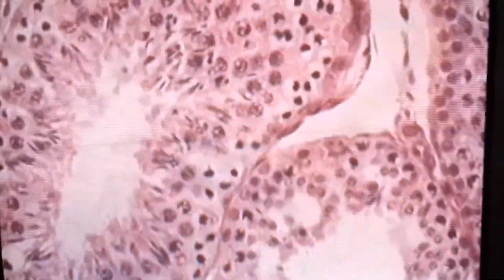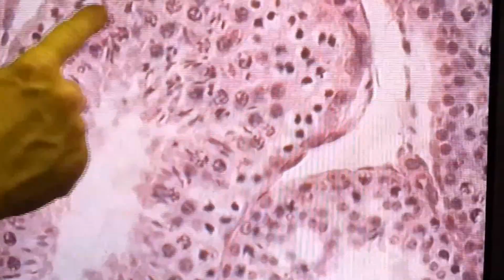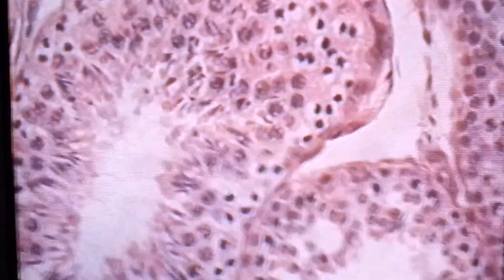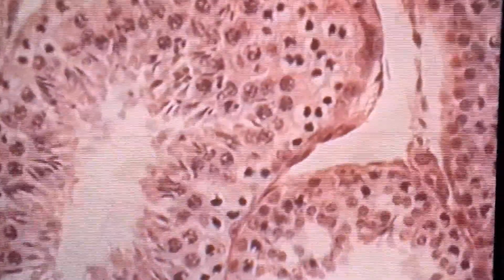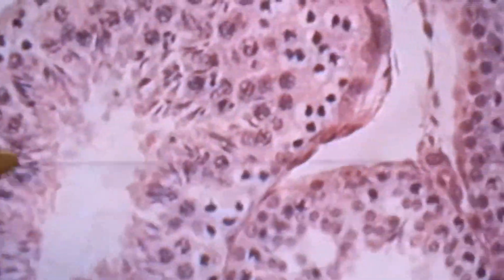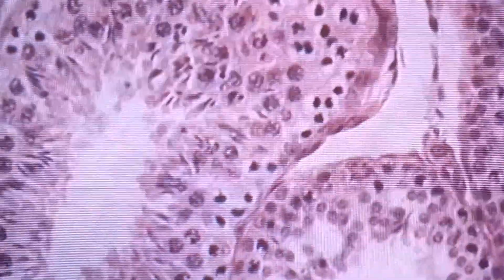You don't usually see them together, so these are all primaries, a lot of them. The primary spermatocytes are those big cells, filled with chromosomes, very obvious, the largest ones. And these are mature sperm. Can you differentiate between secondary and spermatids? Spermatids are pretty clear also.